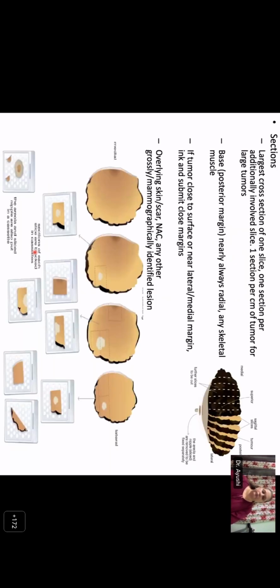And how will that help? So, if you have taken the section in a perpendicular manner and on microscopy there is no invasive tumor, then this is staged as multifocal disease. That means these two tumors are separate. However, if they are pseudopodes of the same tumor, and on taking the sections in the intervening tissue through and through the middle of both the grossly identified lesions, microscopy identifies tumor in the intervening tissue, that means the whole tumor is connected, and then the final T size on microscopic reconstruction will be the dimension of the first tumor, second tumor, as well as the intervening tumor. So the final T size after you have seen the intervening tumor section will become quite big, and of course that has an implication for prognosis.